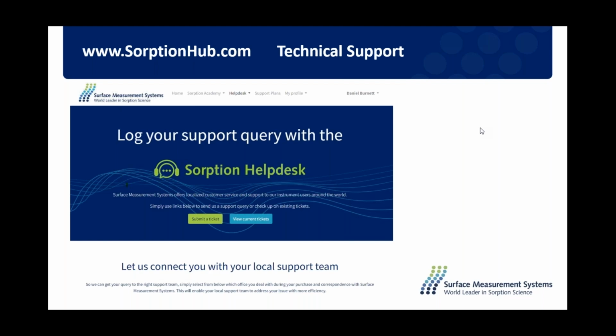Thank you. Why or how did you choose octane for an adsorbent? Is this choice independent of the specific surface area of the material? Great question, and it is something that I did miss. It's related to the fact that octane is non-polar and will typically wet the surface and form a type 2 isotherm. As I mentioned, the only caveat to using the BET equation is that you have to have a type 2 isotherm or type 4 isotherm, which means the molecule will form a monolayer before growing layer by layer.